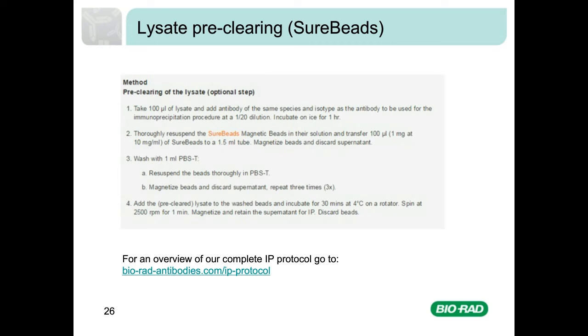For more information about pre-clearing and for an overview of our IP protocol using SureBeads, please go to our Bio-Rad Antibodies website and enter /IP-protocol.